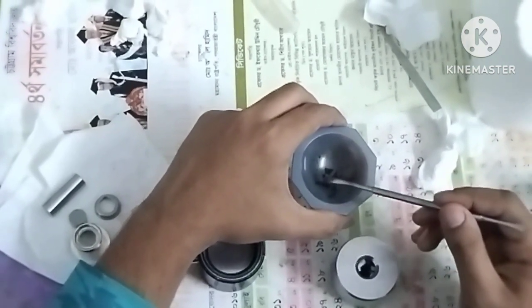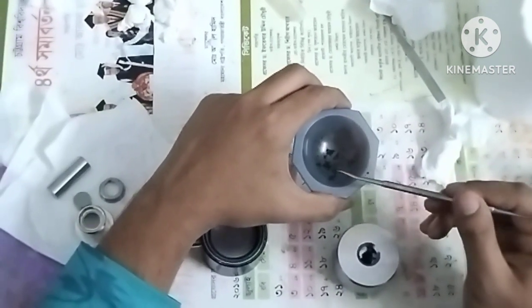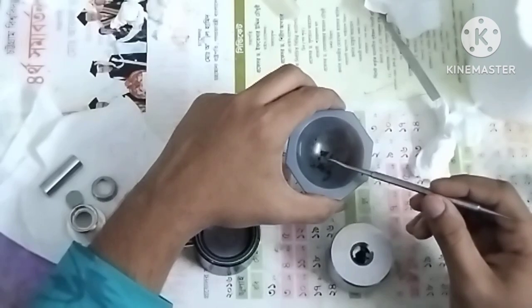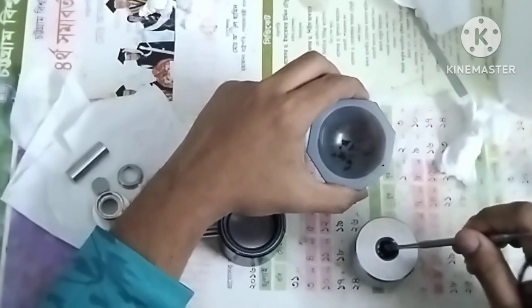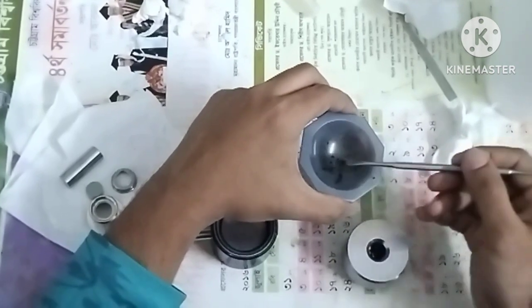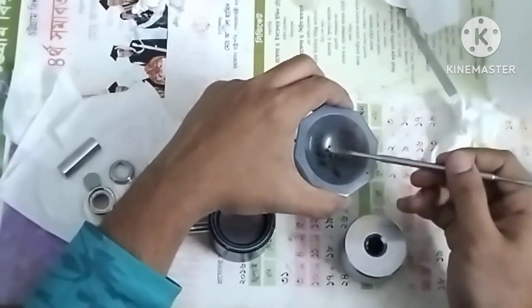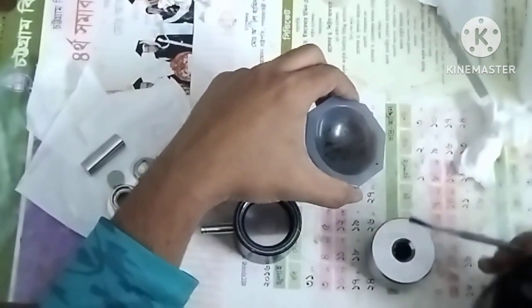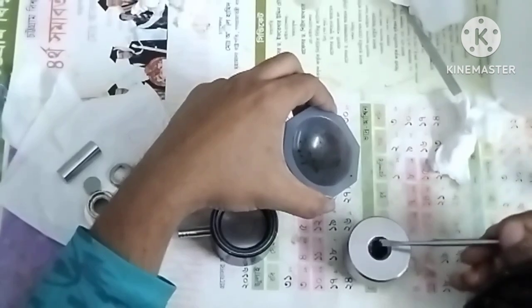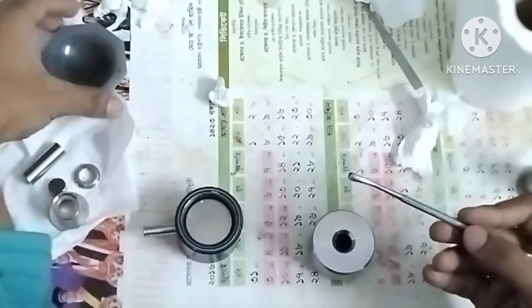When the plate is too thick, it will not transmit the IR ray properly, and it will create complexity in the IR graph. So we have to keep in mind to take the mixture of KBr and our sample in an adequate amount, not larger, not lower.